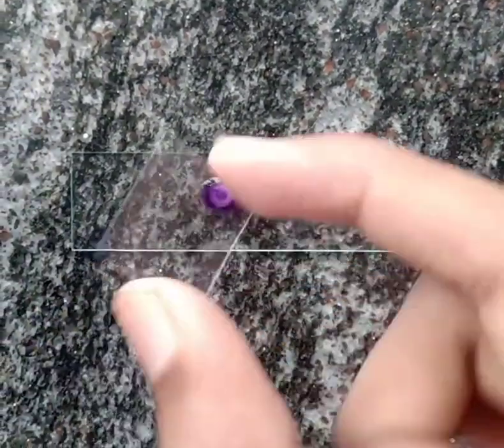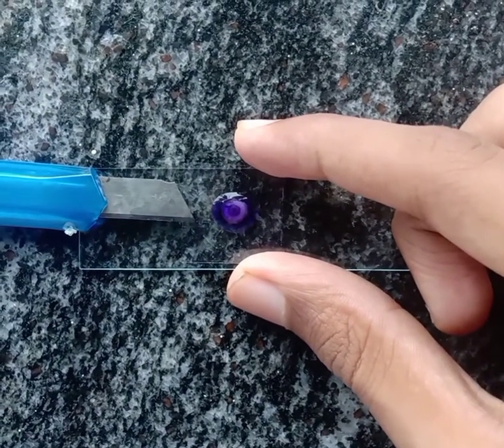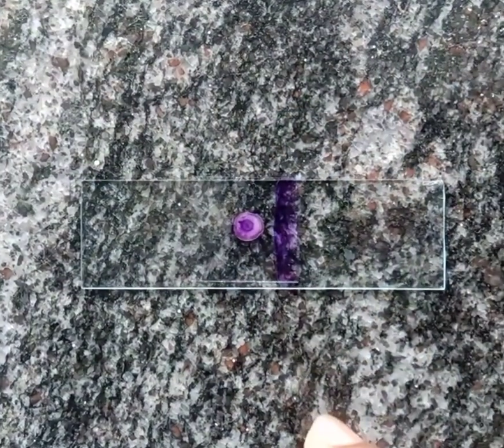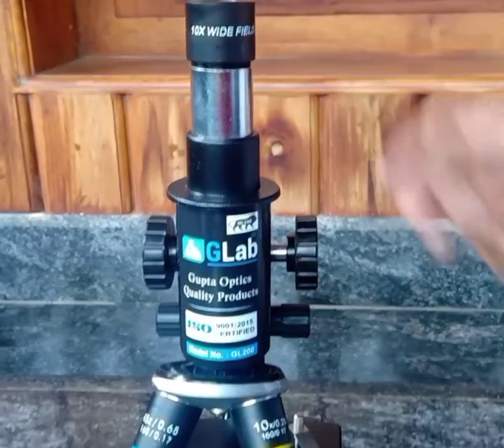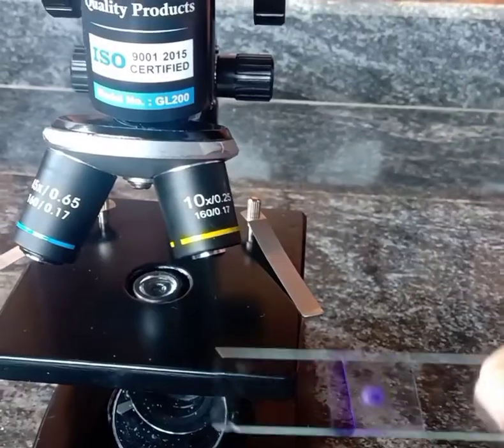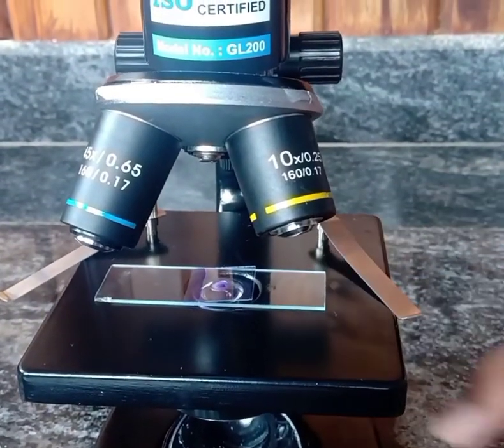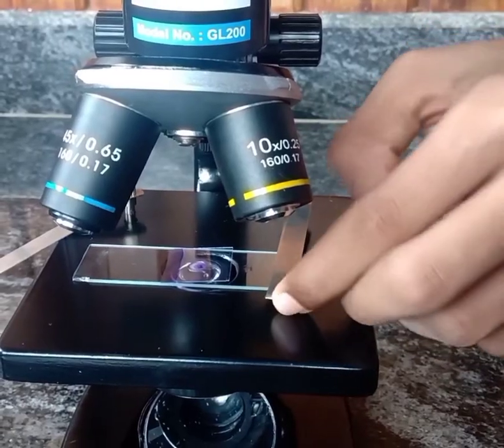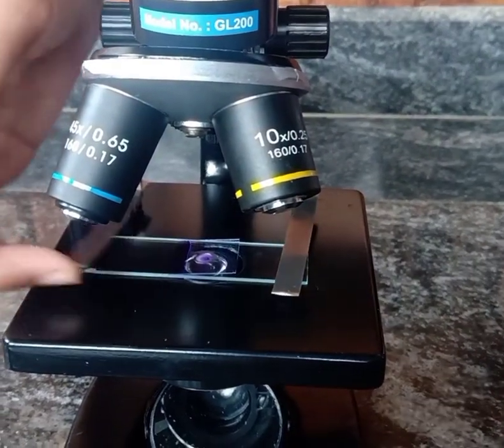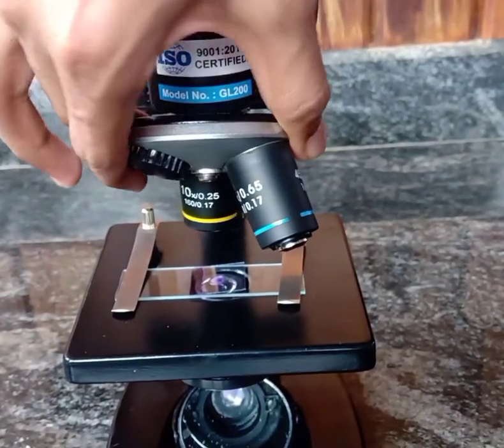Place the cover glass on top of it carefully. Now the slide is ready. The magnification of the microscope is the product of the eyepiece and the objective lens that we use. Here I am using a 10x eyepiece with a 10x objective lens, so the magnification will be 100x. Place the slide on the stage and regulate the light using the mirror. Now it is ready to view.